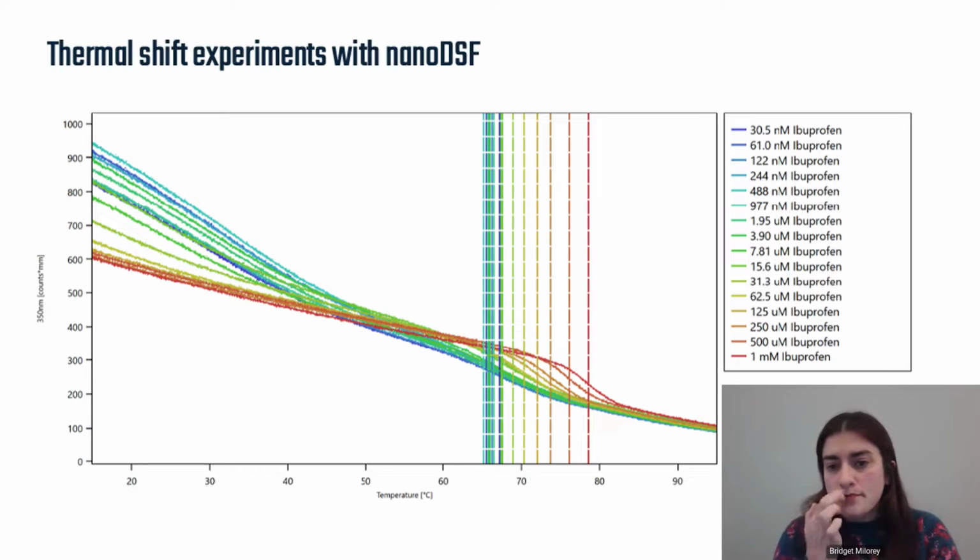Right, of course. And then what about the small molecules? Right. So the small molecules will also not be seen optically in nanoDSF, but you can still do a thermal shift assay to quickly assess whether there was a binding event. Generally, small molecules tend to stabilize proteins that they bind to.